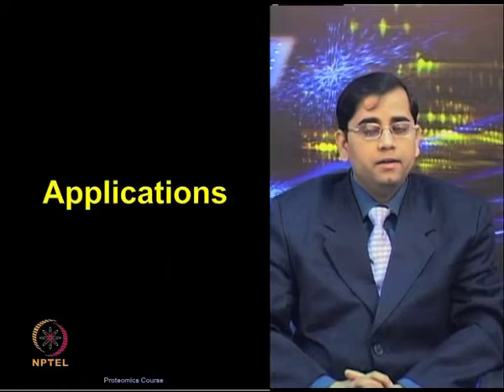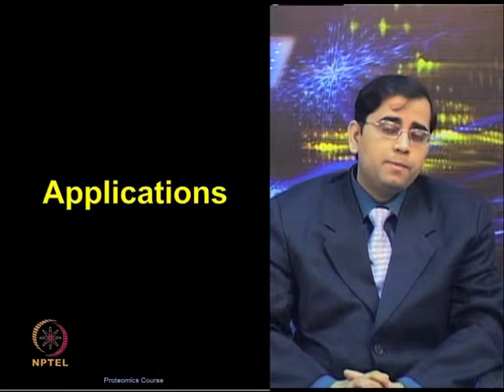After watching this video and discussing the various steps involved in any protein microarray based experiment, let us now look at some applications of cell-free based protein microarrays. Let us first discuss biomarker identification.